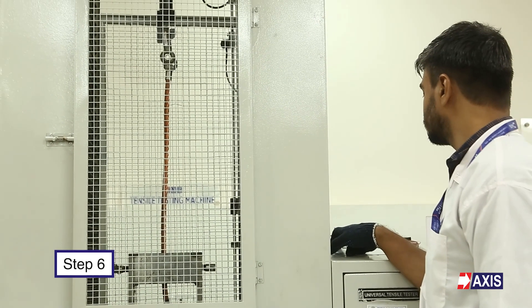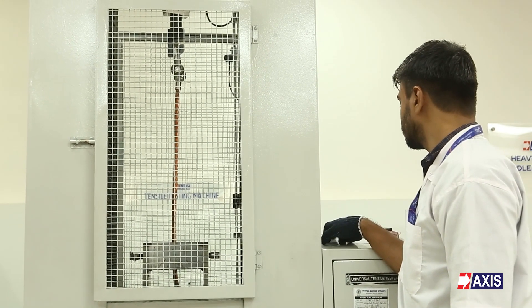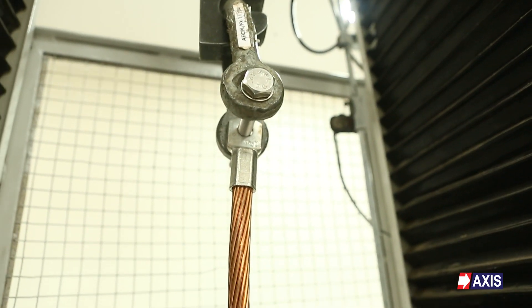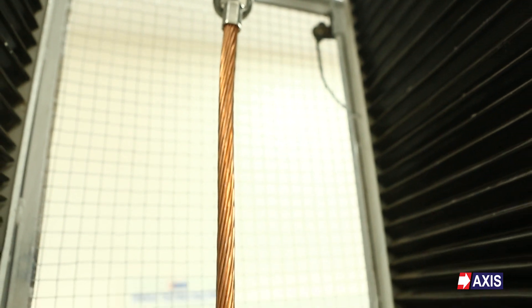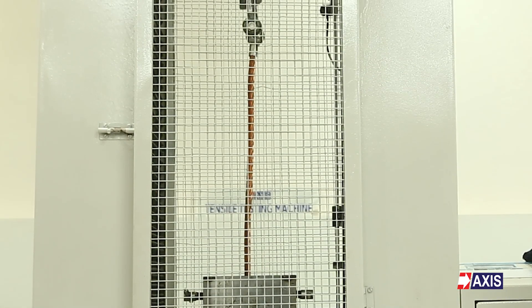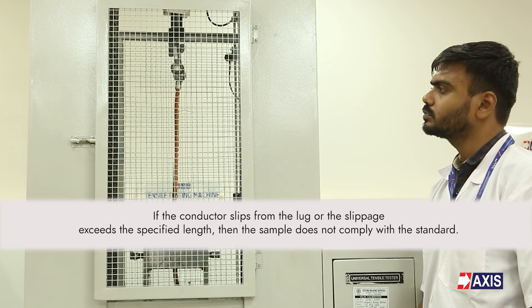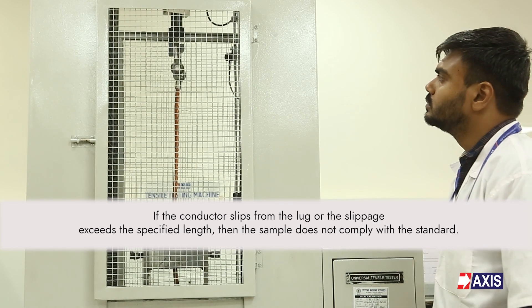Step 6: Enter the load value which needs to be applied for one minute. Step 7: After the test, the machine will stop automatically. Once the test is done, remove the sample and check whether the conductor has slipped from the lug or not. If the conductor slips from the lug or the slippage exceeds the specified length, then the sample does not comply with the standard.